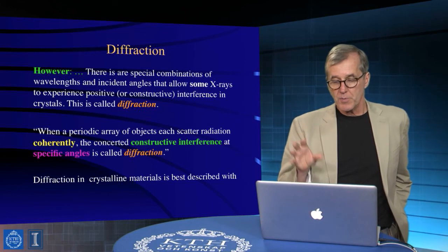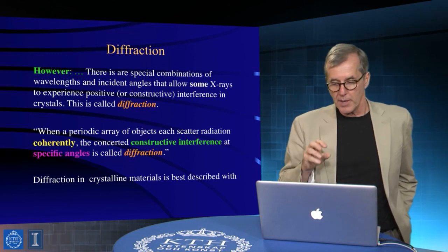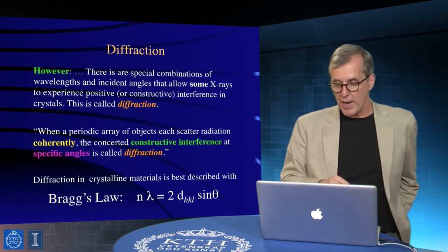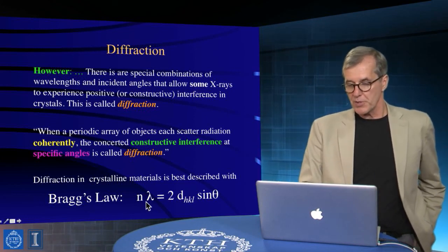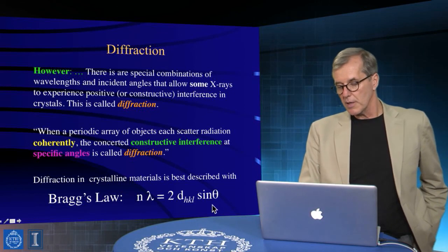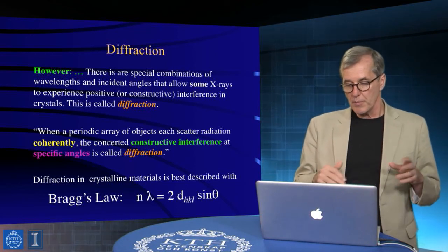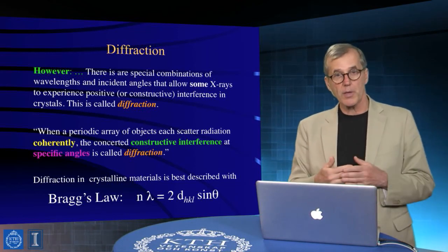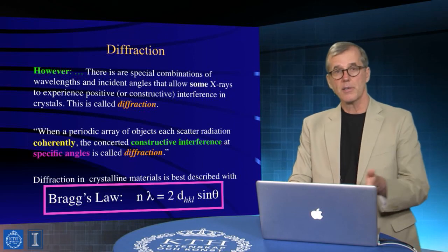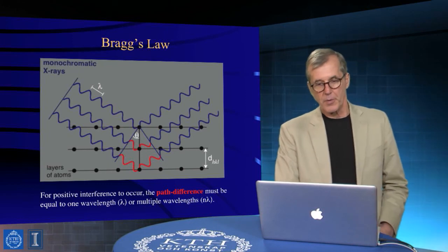these specific forms of constructive interference, when analyzed in terms of these angular attributes and whatnot, can be analyzed according to a very fundamental relationship, and that is Bragg's law. That relates dimensions of periodicities and wavelengths, and the angular attributes that the scattering is done off of a crystalline material, in a way that actually begins to let us define something related to the crystalline habit of a material, right? So Bragg's law is the fundamental revealed form of truth in this method of analysis, right?